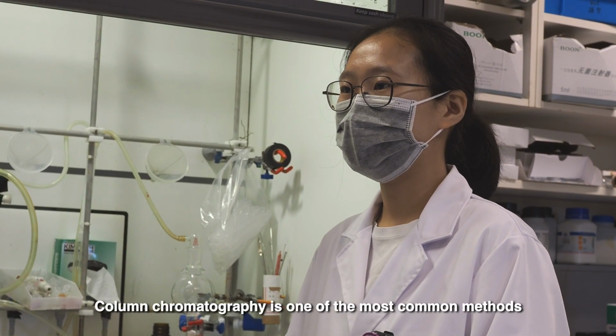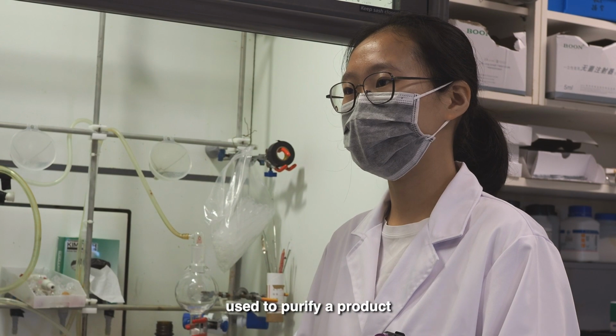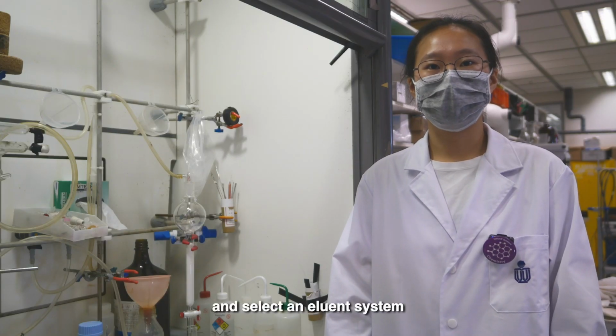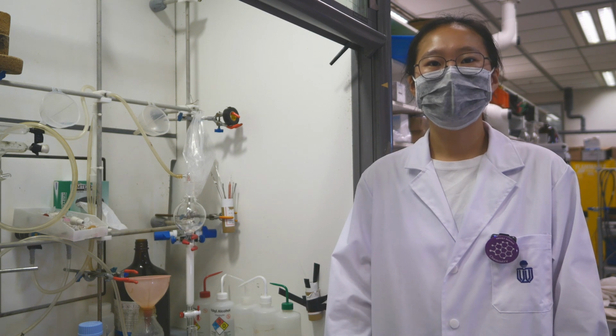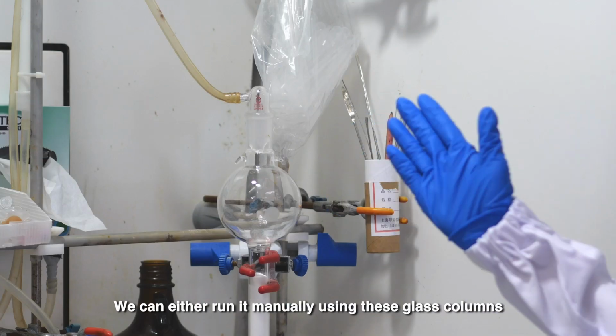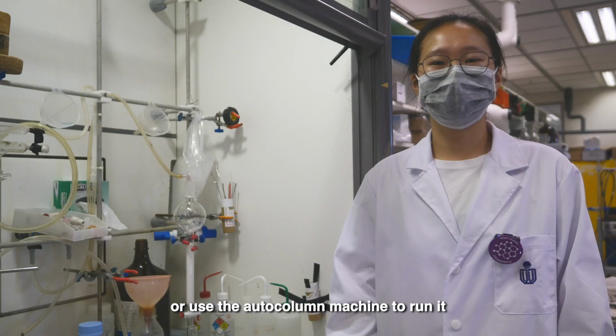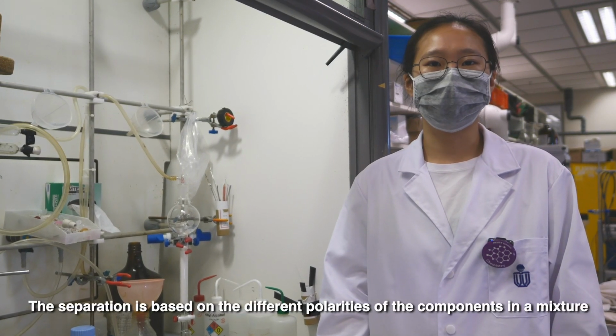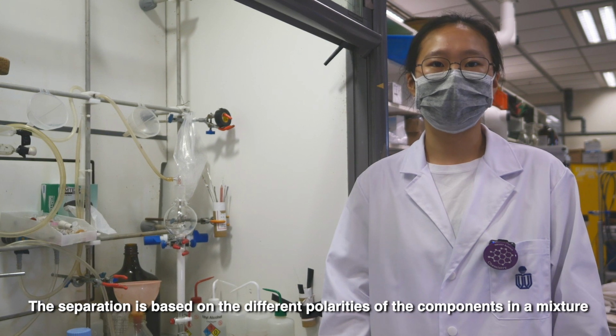Column chromatography is one of the most common methods used to purify a product. We pack the column, load the sample, and select an eluent system. We can either run it manually using this glass column or use the autocolumn machine to run it. The separation is based on the different polarities of the components inside a mixture.